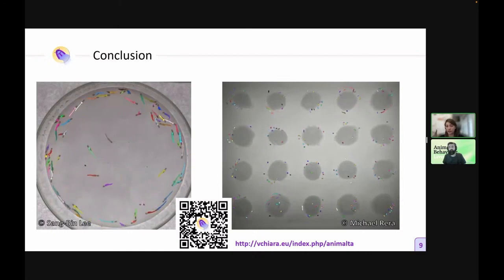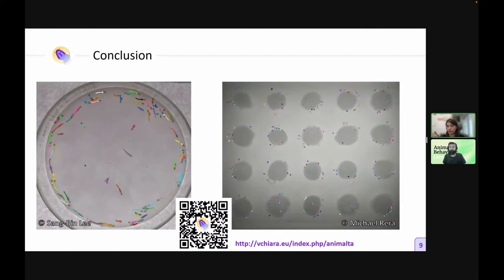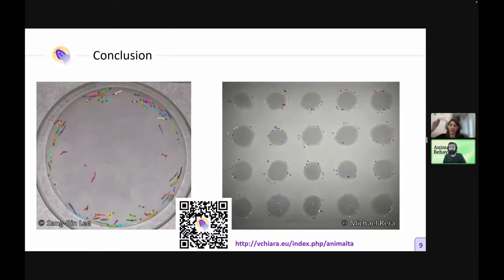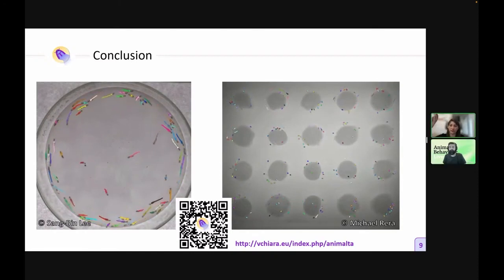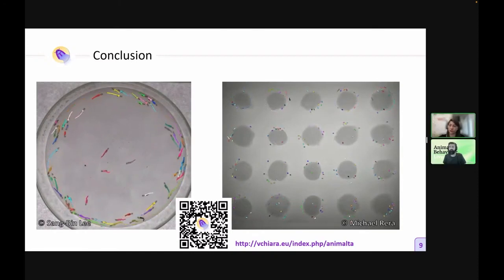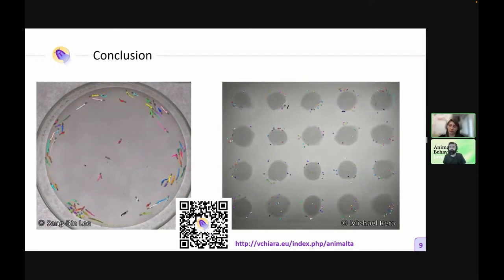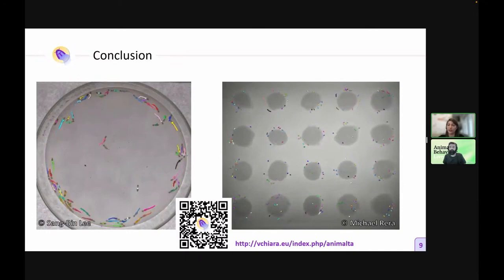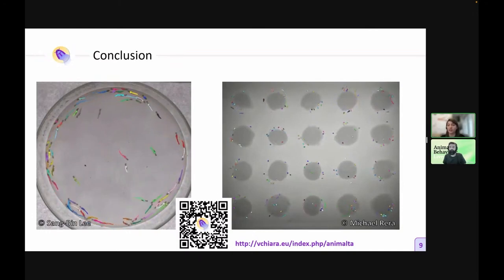What you can do is create an arena of interest that's a little bit bigger than your hiding zone. So the target is detected just before it enters and just after it leaves, and the program has the transition, the entrance and the exit, and then it will consider that all the time the animal was missing, it was inside this arena.